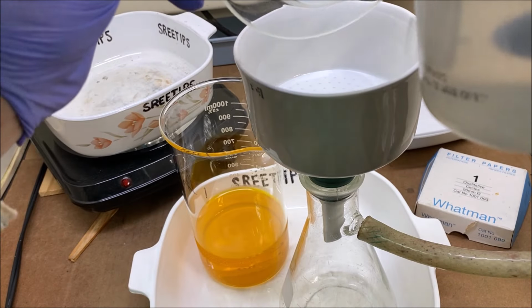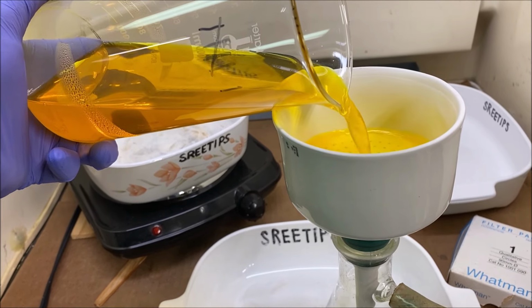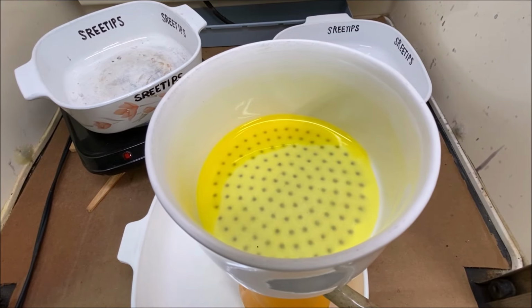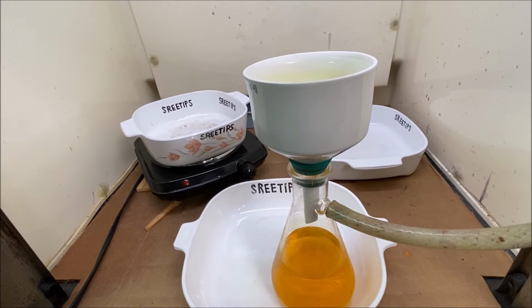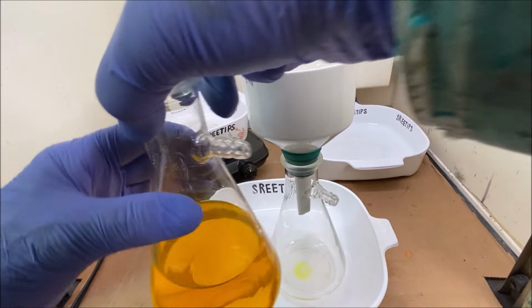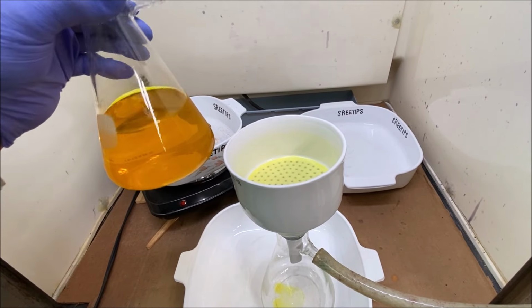Let's go ahead and filter our gold solution. There's a little bit of trash in there. And as you can see, the solution looks a little on the cloudy side. So what we'll do is we'll try pouring it back through the same filter a second time. Now that this filter is loaded up, it will be able to filter out finer particles that are suspended in our gold solution.